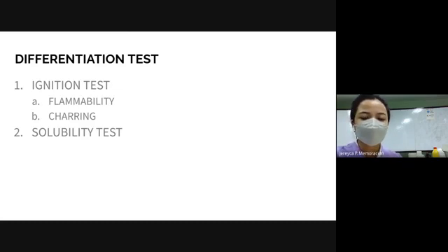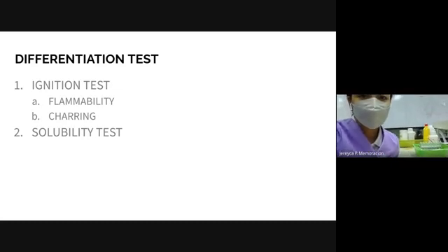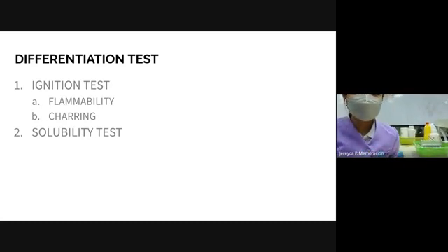As I have shared with you, according to your lab manual, let's start with the flammability test. We need ethyl alcohol in an empty, dry, transparent glass.